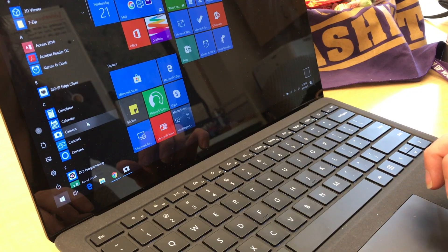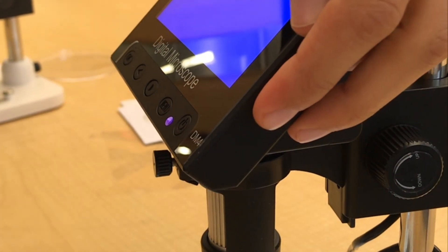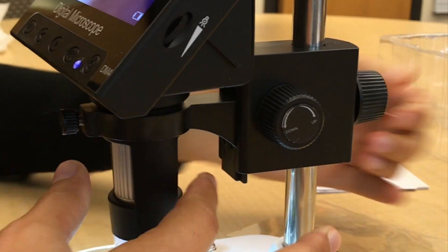After you plug it in, you can open the webcam or software and wait for it to connect. You can adjust the brightness of the scope's light and the height and focus of the scope.